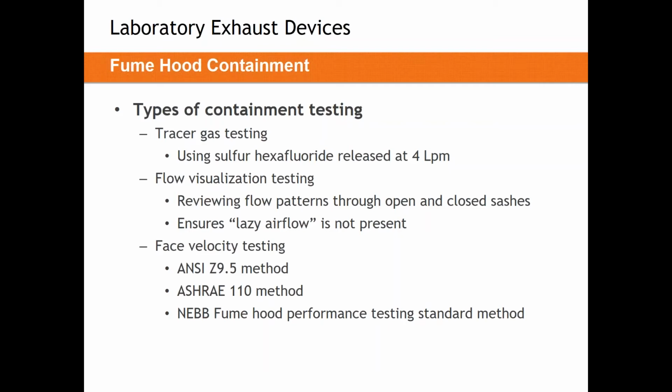When we're doing tracer gas testing, this is defined in great detail in ASHRAE 110. However, while that standard breaks down how you should release the gas, where you should release it, how you should collect data, how often, it describes every part of this test extremely well. What it will not tell you, and it's very straightforward about this, is what the correct amount of containment is. That is for the facility staff, operational health and safety. It's for the facility and the design engineers to determine for themselves. Nobody will give you a straight answer about what the right number is. That's up to you and your application to define.